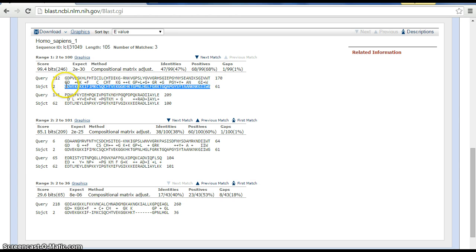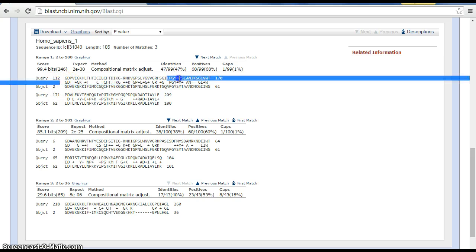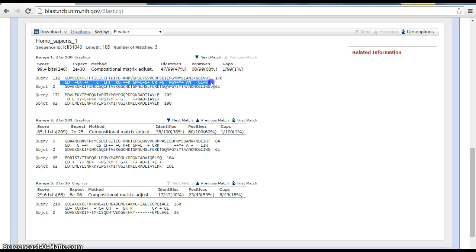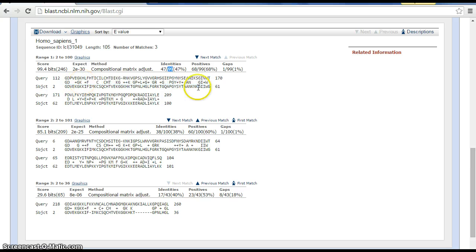Notice where it enters the letter in the middle row. Where you see an amino acid letter, that means there's a match. Where you see a blank or a plus, that means there's no match.